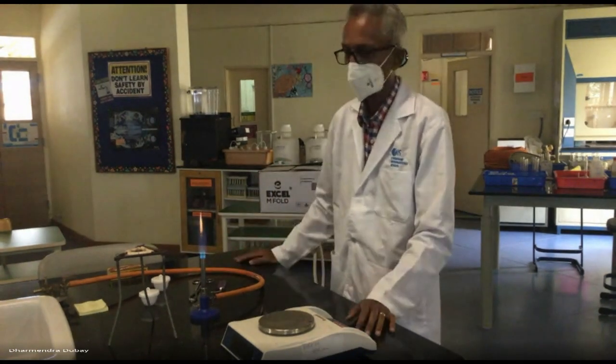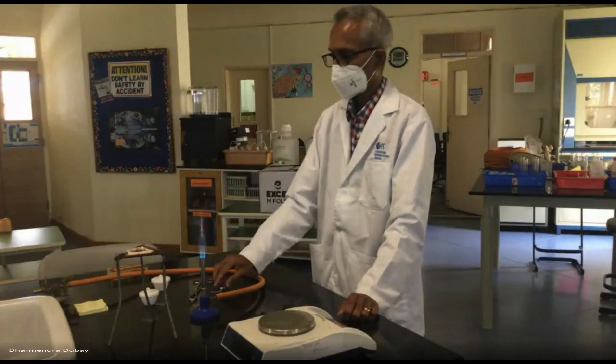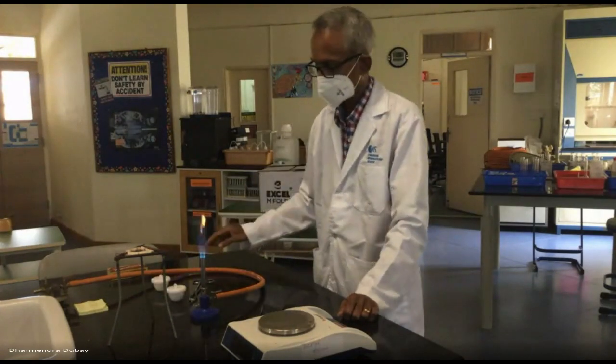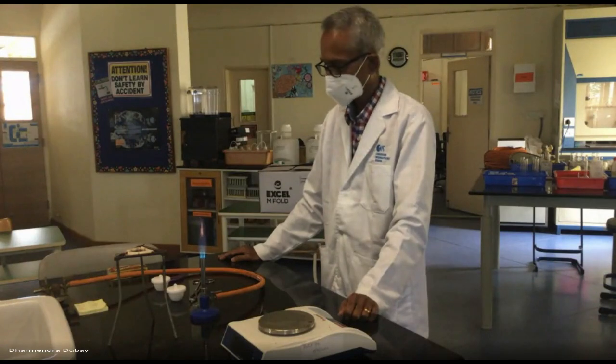Whether it is increase in mass or decrease in mass. It will decrease? That is kind of like a natural answer for people to have. But I want you to think about, we are going from magnesium, aren't we?